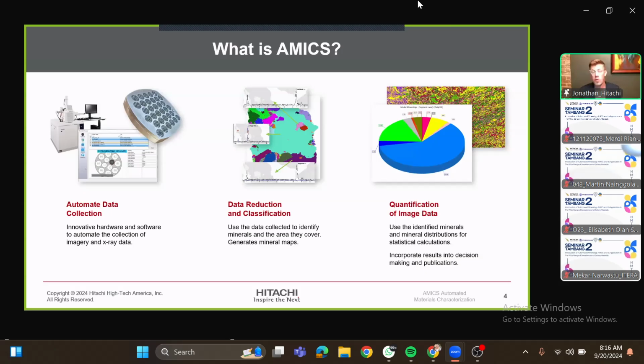It also means that we can generate methodology to classify each of these rocks by generating a database of reference spectra and matching each individual point to that database of reference spectra. Now, you don't need to understand how this works. Anyone that's really interested in how this works, you're going to see a little bit more of it when Dr. Chi Li gives a presentation a little later.